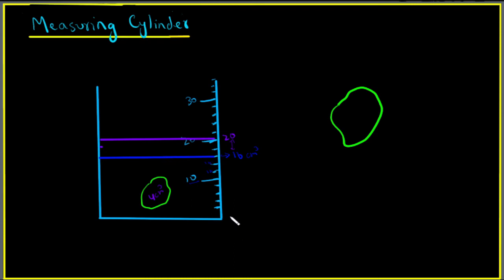And one important tip that I can give you at this point is that you always need to look into this measuring cylinder to see the reading parallel from the axis of, for example, this is your eye. You just need to see directly from here.